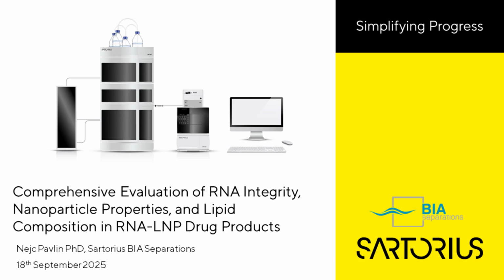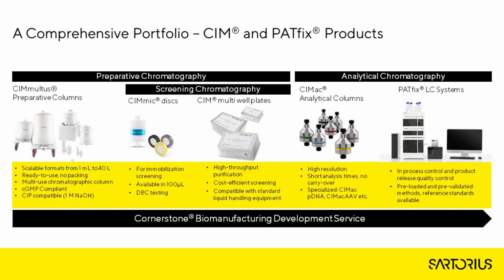Today's webinar will be about our chromatography solution for analyzing lipid nanoparticles. We recently published this analytical method in an article. Today's webinar will go through how this method works and everything we can see using this method, and so on.